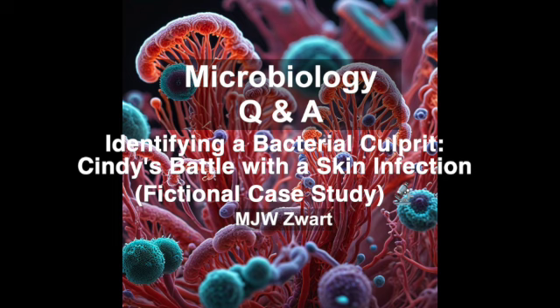So what happened when they performed the gram stain on Cindy's sample? Well, when they viewed the stained sample under the microscope, they saw that those same spherical bacteria, clustered like grapes, were now stained a deep purple color. And that purple color means? That these are gram-positive bacteria. Their thick cell walls retain the purple dye during the staining process.